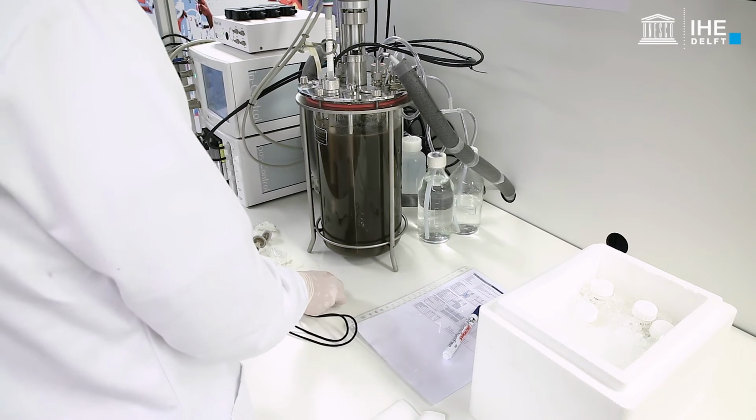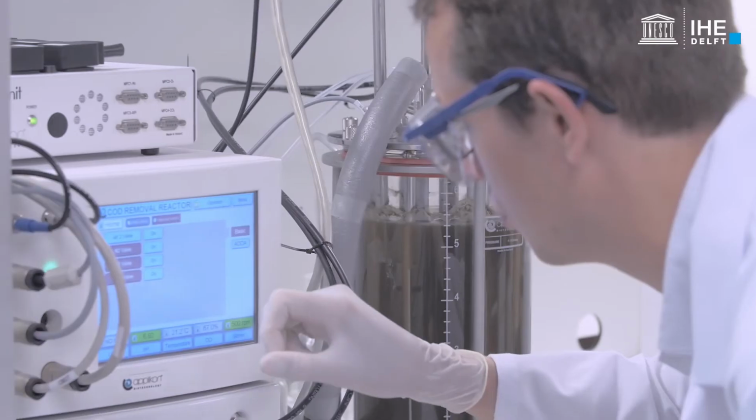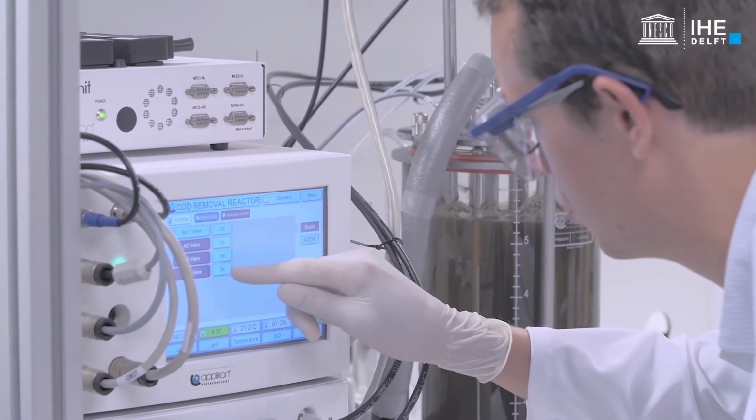If the external aeration was temporarily turned off, do not forget to switch it on after the preliminary samples are collected.